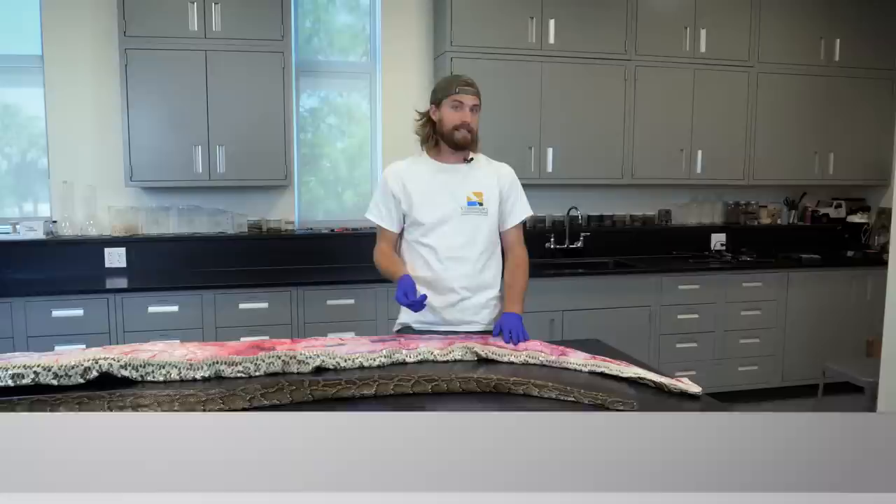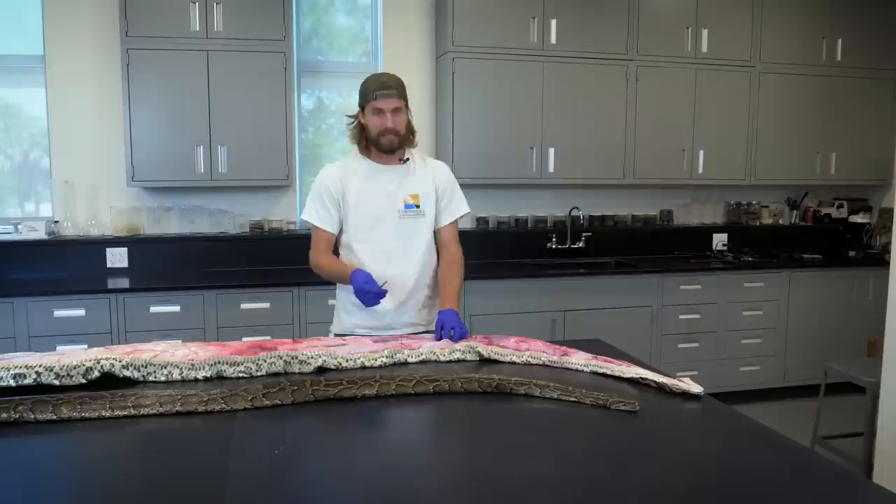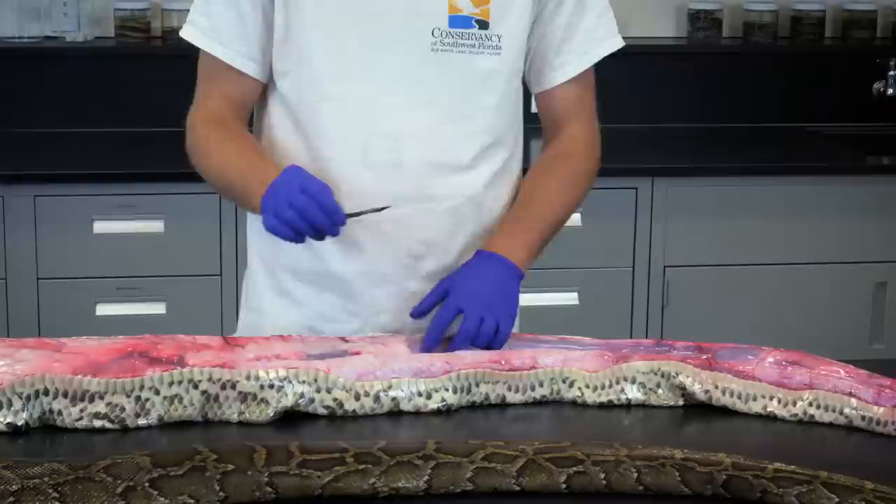Now that we have the snake cut open, the first thing I'm going to do is take a look at the internal organs up here at the top. I have the heart, I have the liver, and I also have the lungs. What I'm going to look for in the lungs is actually a parasitic crustacean that sucks the blood out of the lungs.